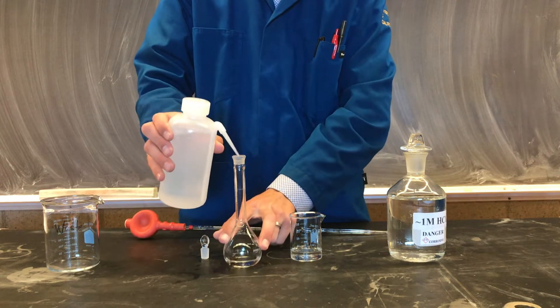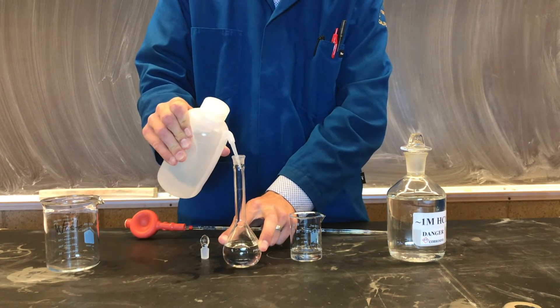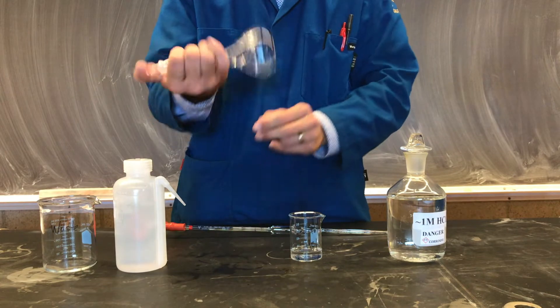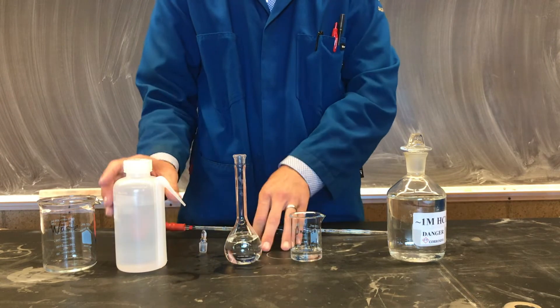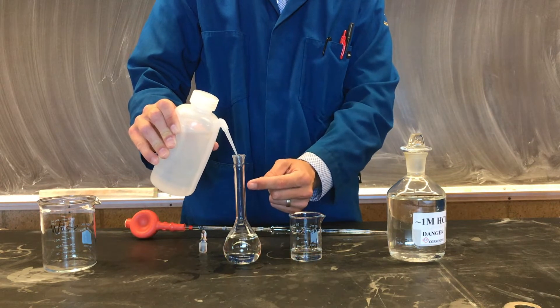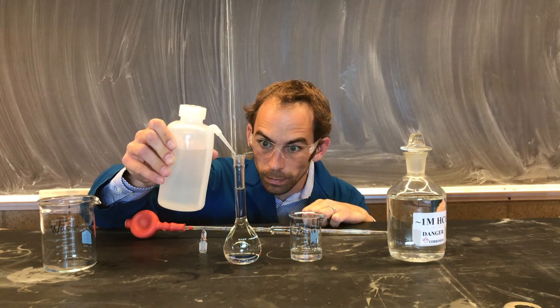We can then dilute our solution to 100 mL in our volumetric flask. We should shake vigorously to ensure our solution is mixed. Note that our volumetric flask will measure exactly 100.00 mL when the meniscus is on this line. This solution is now called our diluted hydrochloric acid solution.